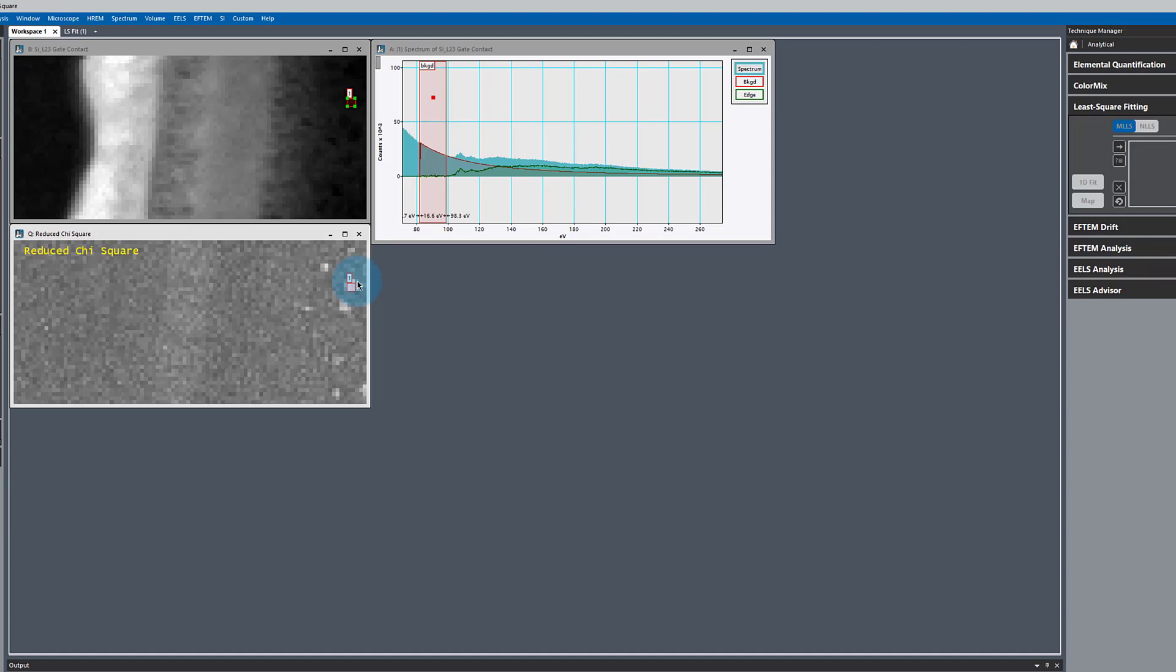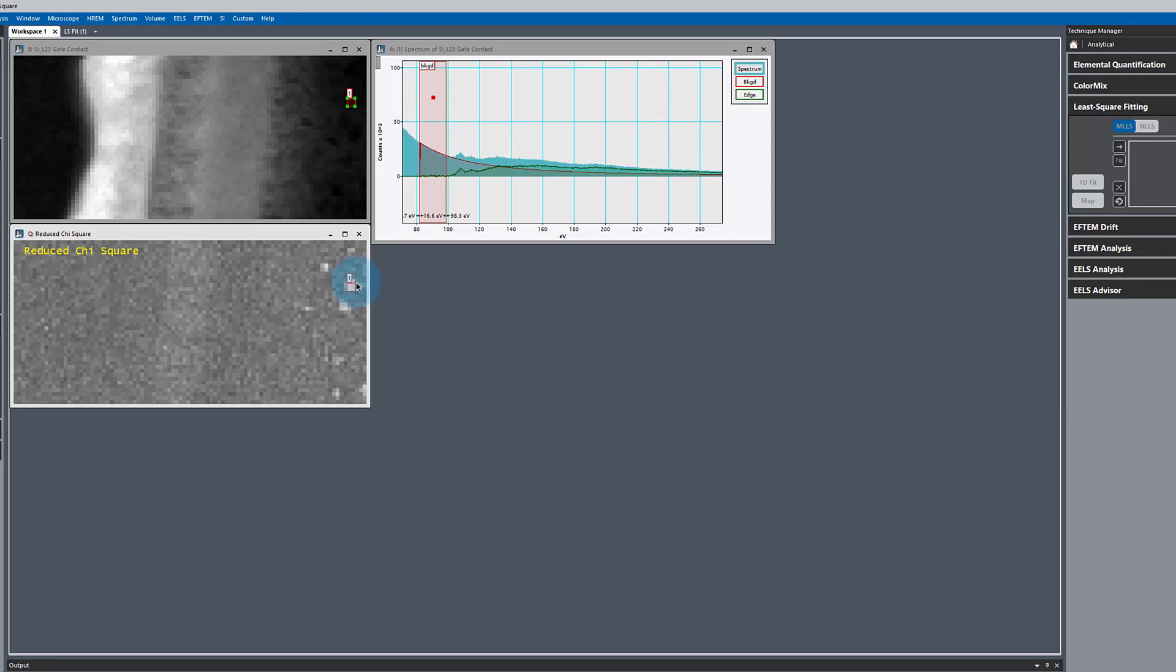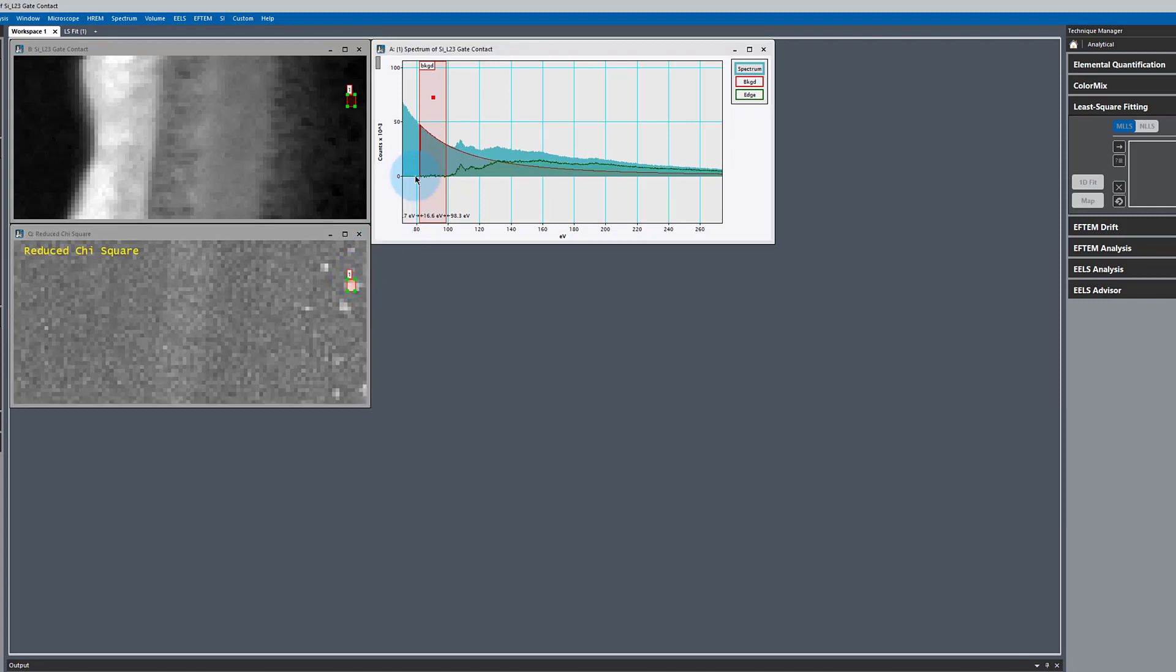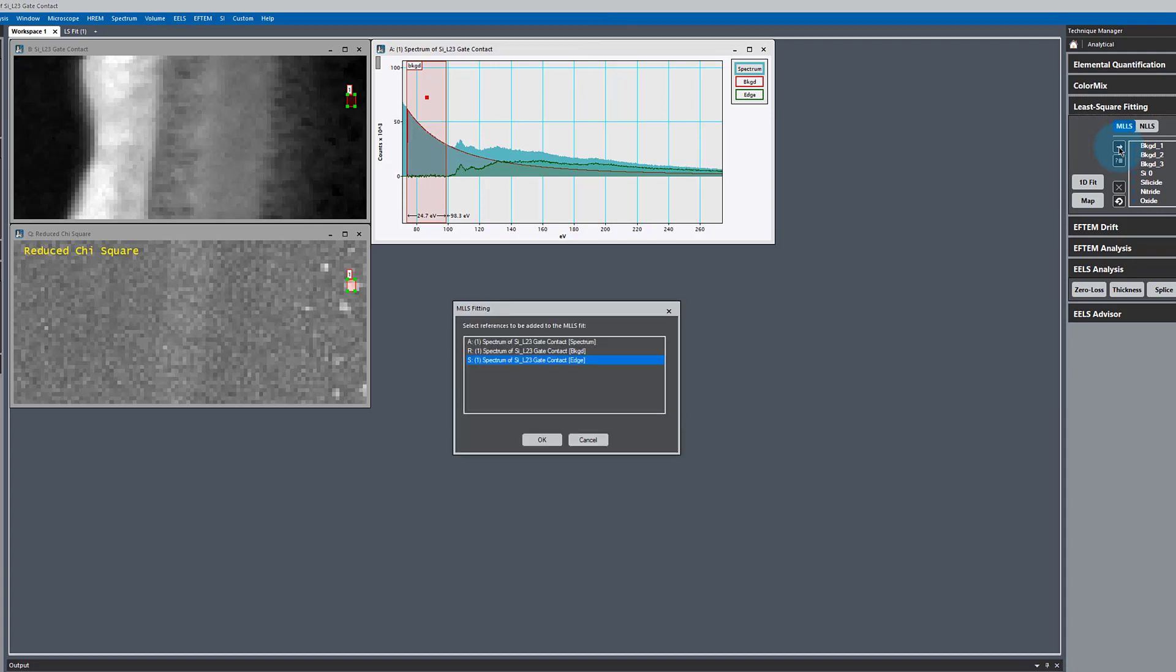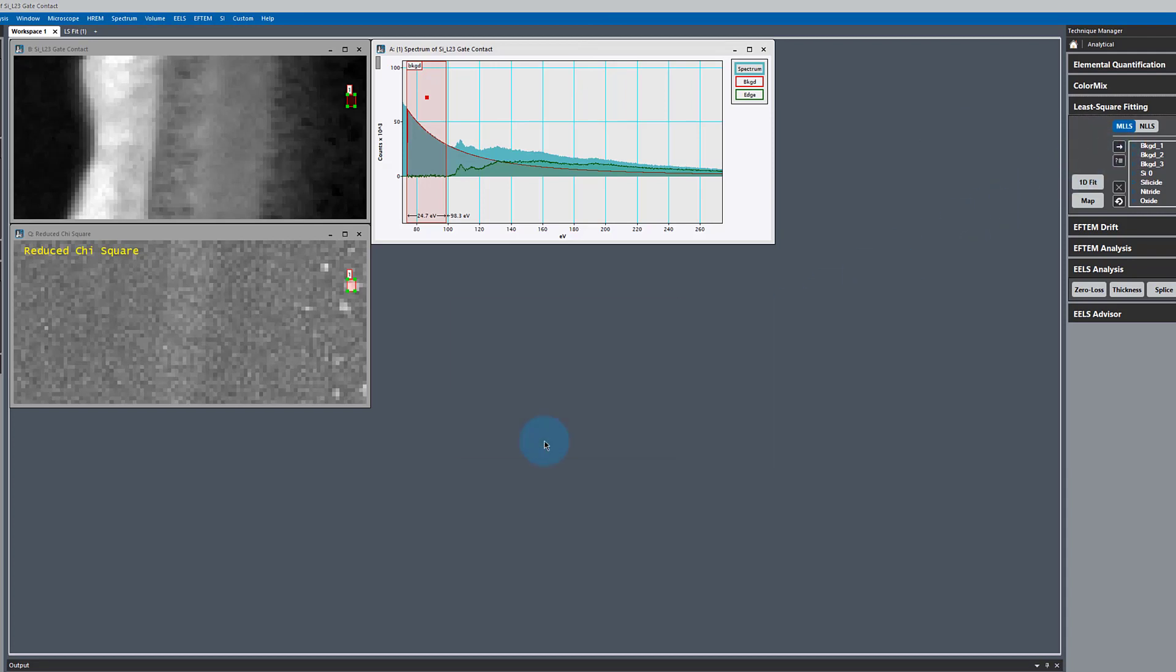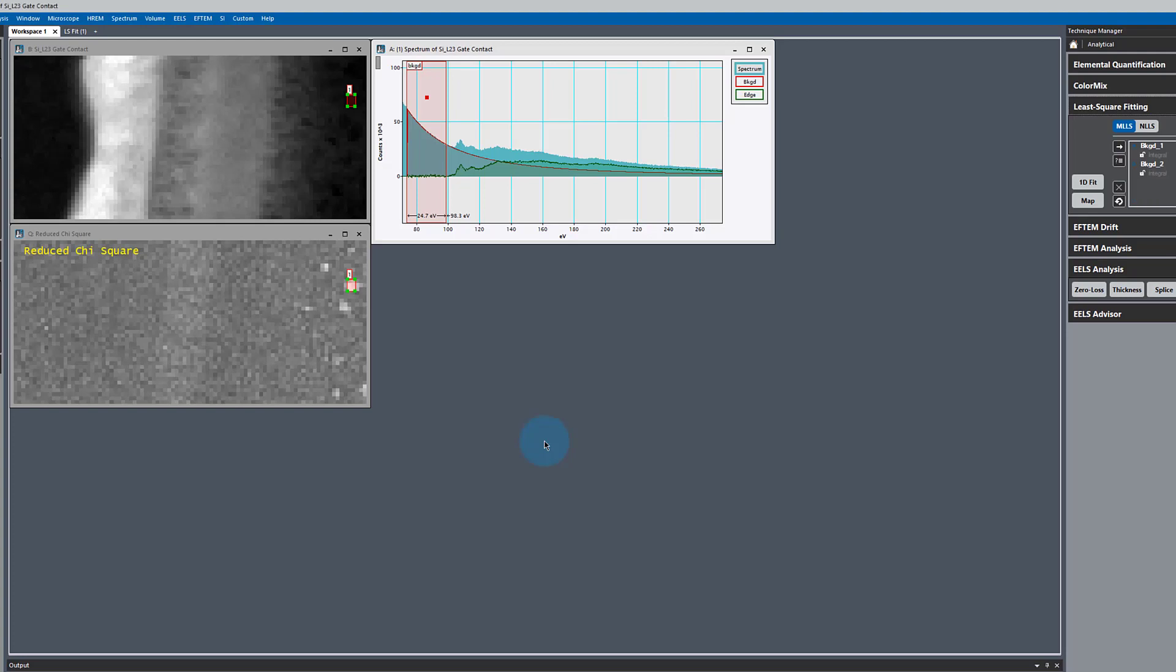We can use that information to create another reference. The chi-squared is telling us where we did a poor job in our fitting. You might want to extend that out, get a couple more pixels there, but make sure we stay in that region of poor fit. Make sure our background fits well, and we'll add that to our fit, just the edge because the background is fitting okay. We'll call that suboxide.